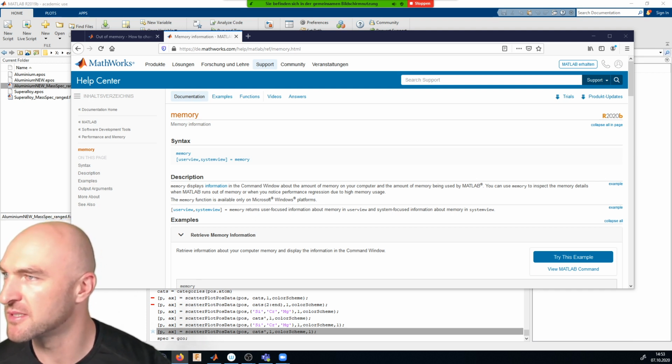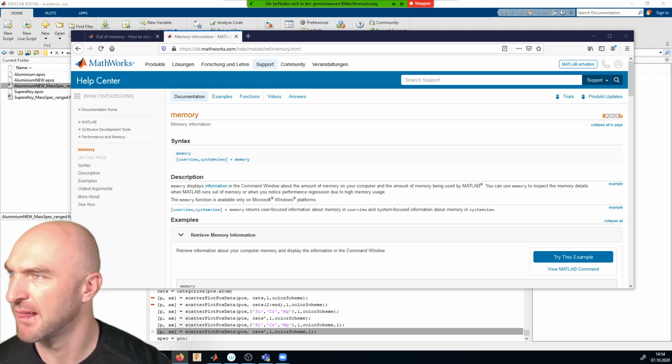So we still had one. Cynthia Rodenkirchen got lost on the error post allocate range: dot indexing not supported for variables of this type. Okay, that's a weird one, because dot indexing is definitely supported. SA is post allocate range.